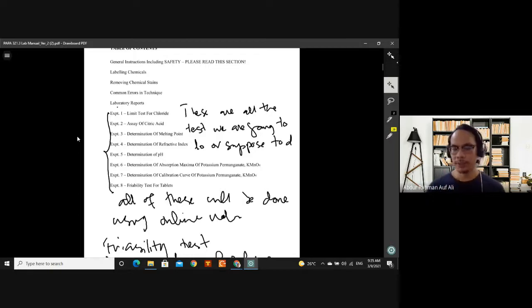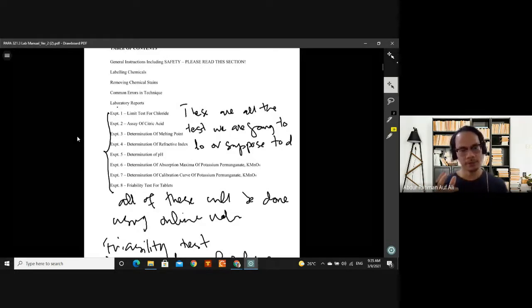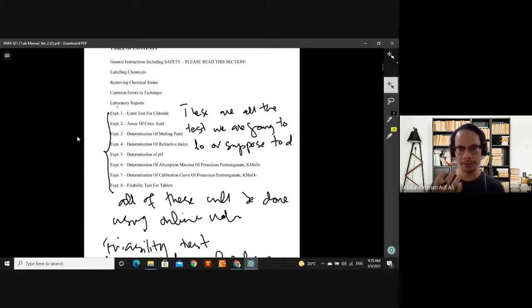Okay, but just for your info, if you work in the industry, we use N95 carbon-based masks. If we had to deal with very highly concentrated chemicals, you have to wear those respirators that you see people wearing in hazmat suits, with the carbon filters on the side. So in KPGUC, we don't use them.